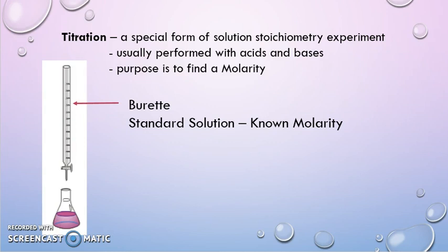While the second solution, we really don't know anything about, and that would go down here in the flask. We call it the analyte. Again, the analyte has an unknown molarity.